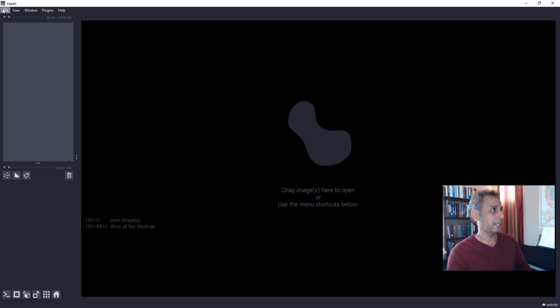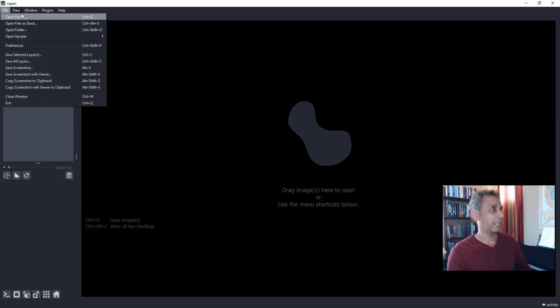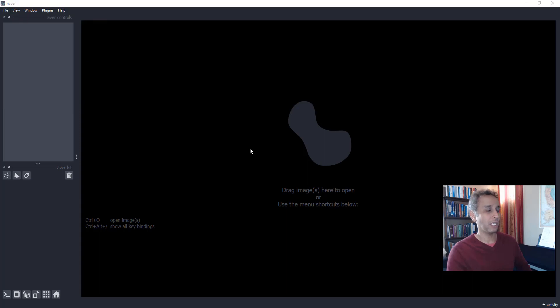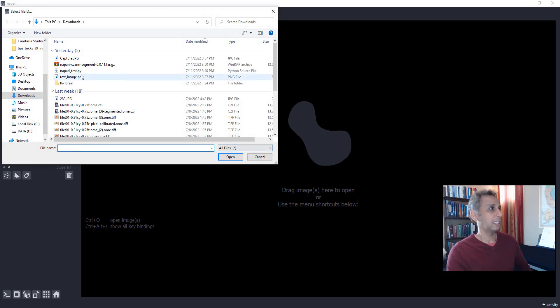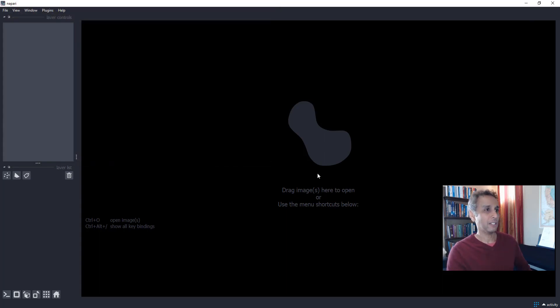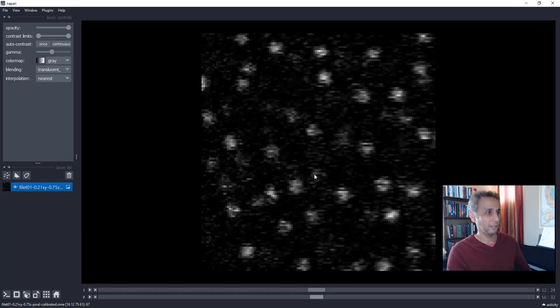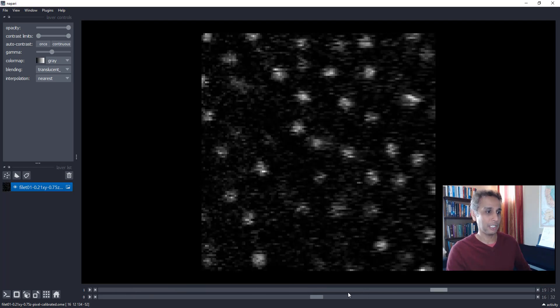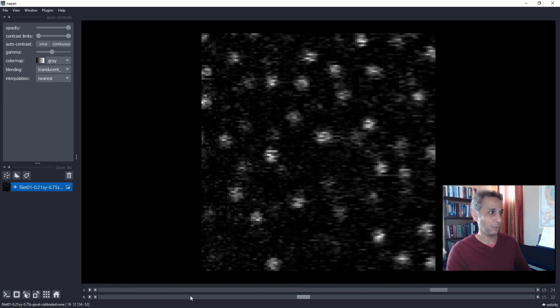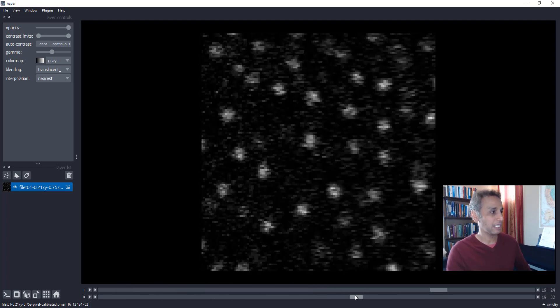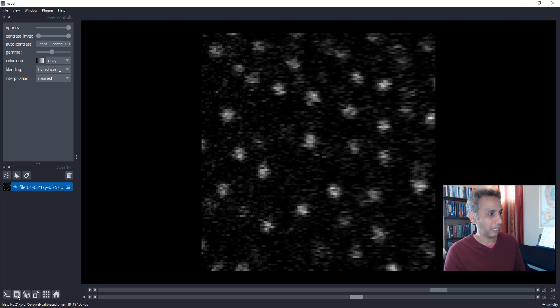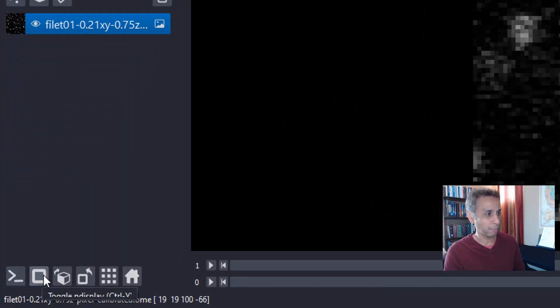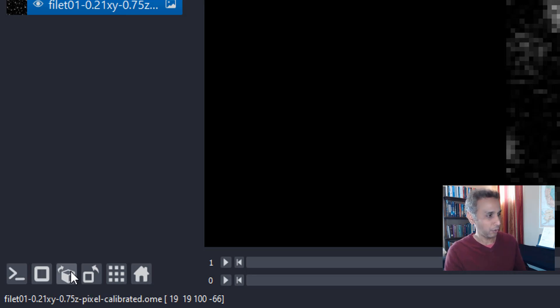So now we have this. Now I can go ahead and file, open. So let's open the file one more time. The OME-TIFF file. There you go. And now you can slide through your Z-stack, slide through your time series.